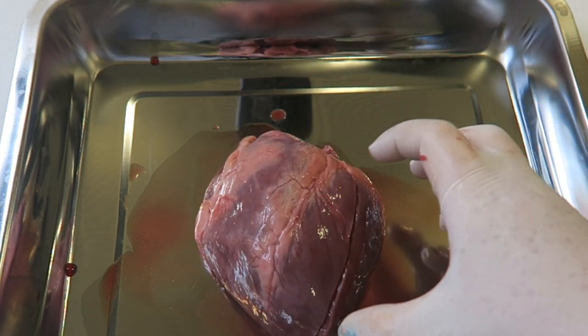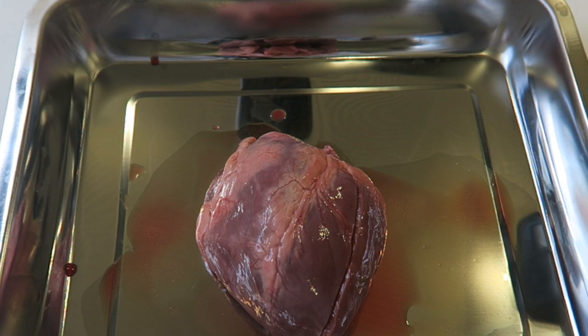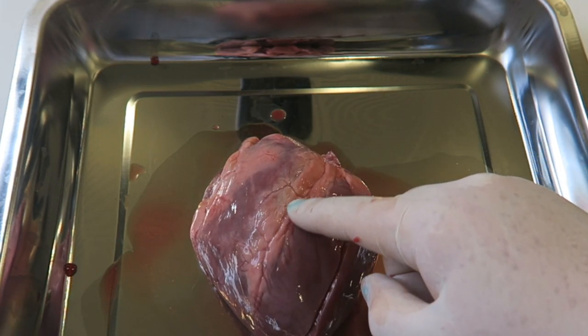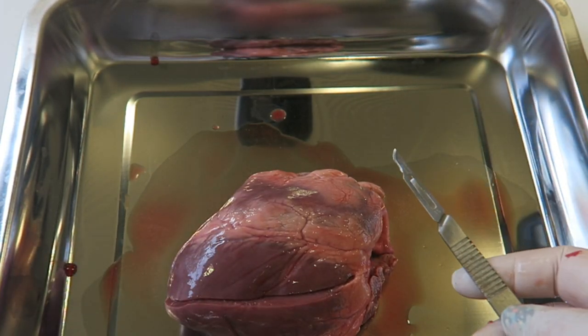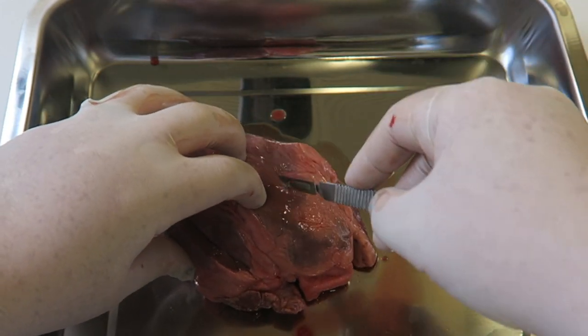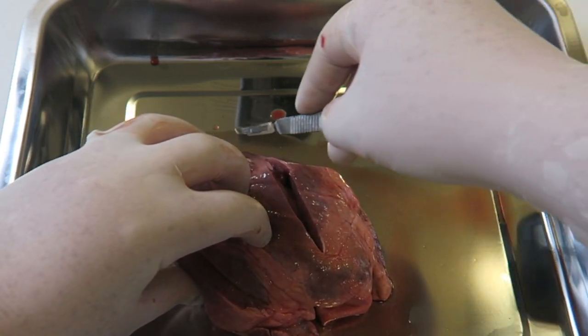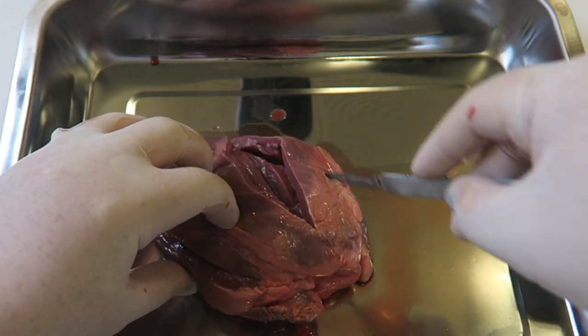So now we've looked at the left side of the heart, we're going to have a look at the right side of the heart, and we're going to make our incision again in line with the coronary artery. Now you can do this whichever way you want. Just to make my life easier, I'm just going to turn this upside down. And again, with the gentle strokes, we are not trying to hack this to death.